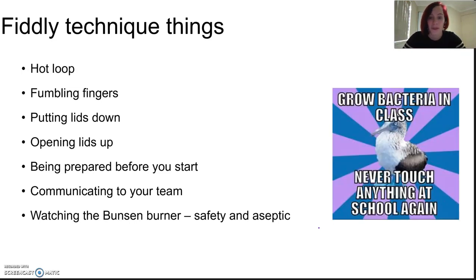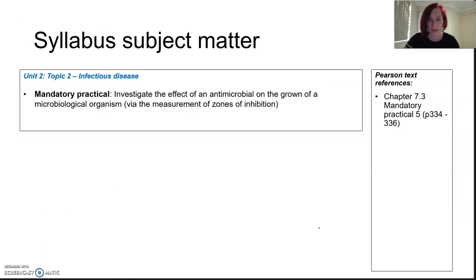But it will give you a really good understanding of what kinds of things you can grow. But we really don't want to grow anything pathogenic, so we obviously aren't going to open it up and breathe anything in. Okay? Really important that you have a read of your method before you come to class, please.